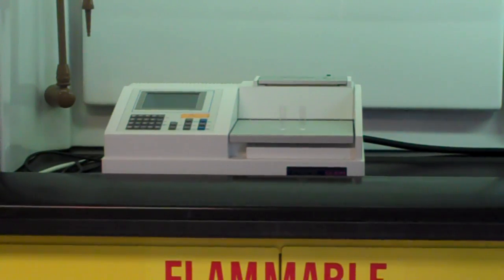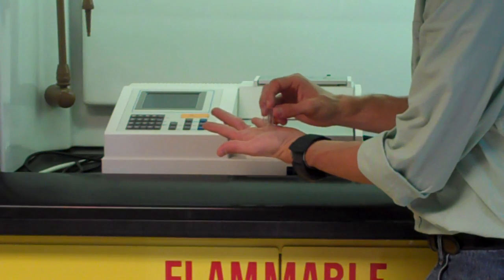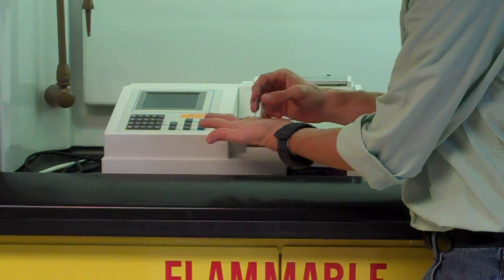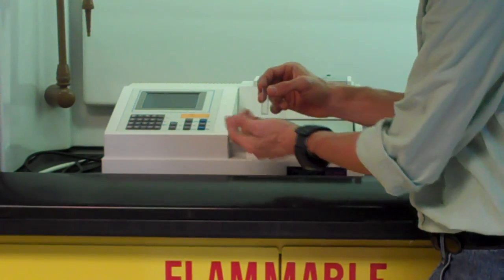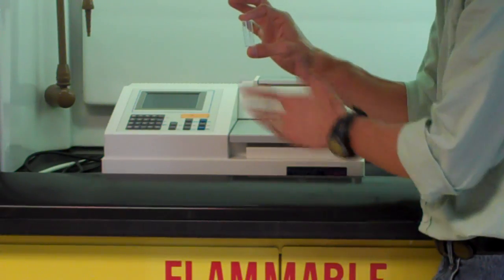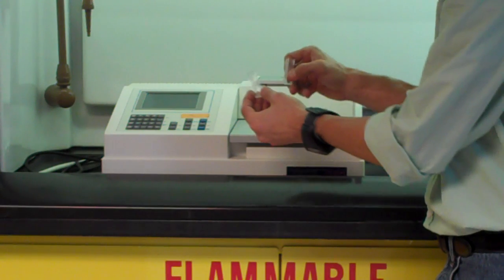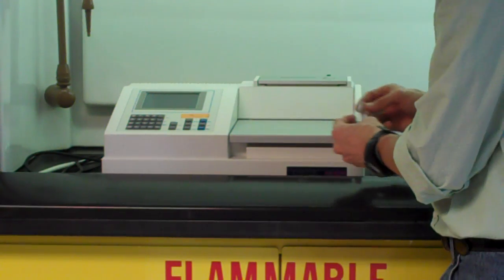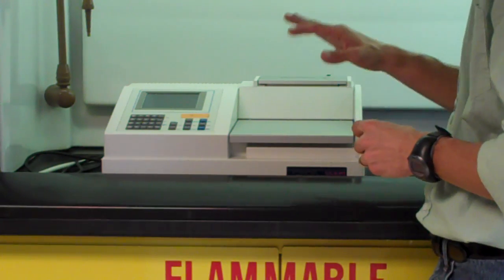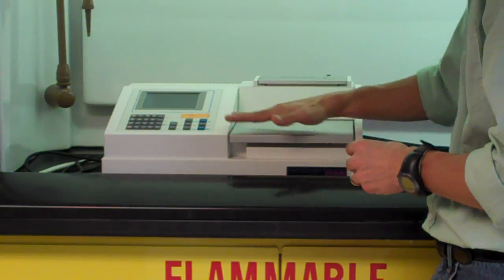Okay. And they're hard to see, I can appreciate on the video, but these are the cuvettes that we use. You'll first mix your reaction in a beaker, stir it for a few seconds, and then you'll simply pour the reaction into one of these cuvettes, and that's it. You can leave it go for the rest of the lab. Now you'll prepare two separate reactions, so you'll need two cuvettes, and you'll need one cuvette as a blank. We have to blank out the spectrometer to tell it what is a zero absorbance.